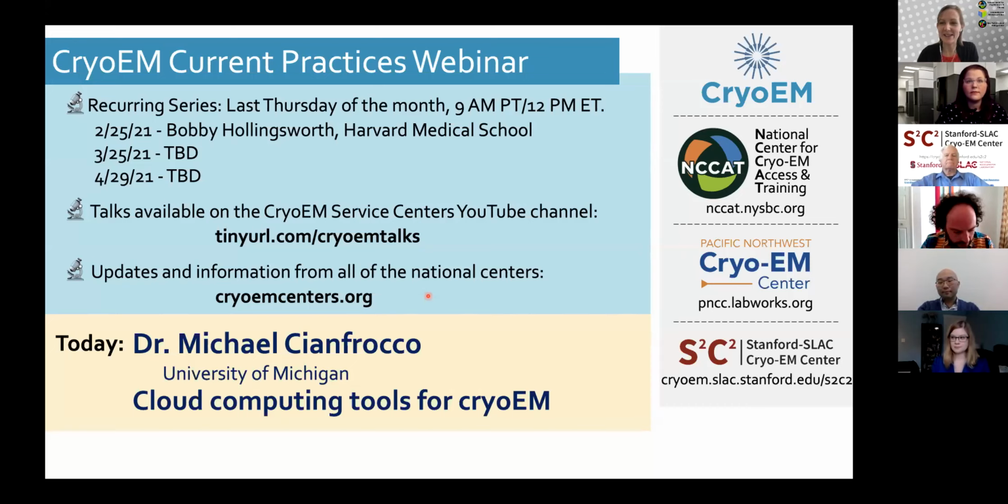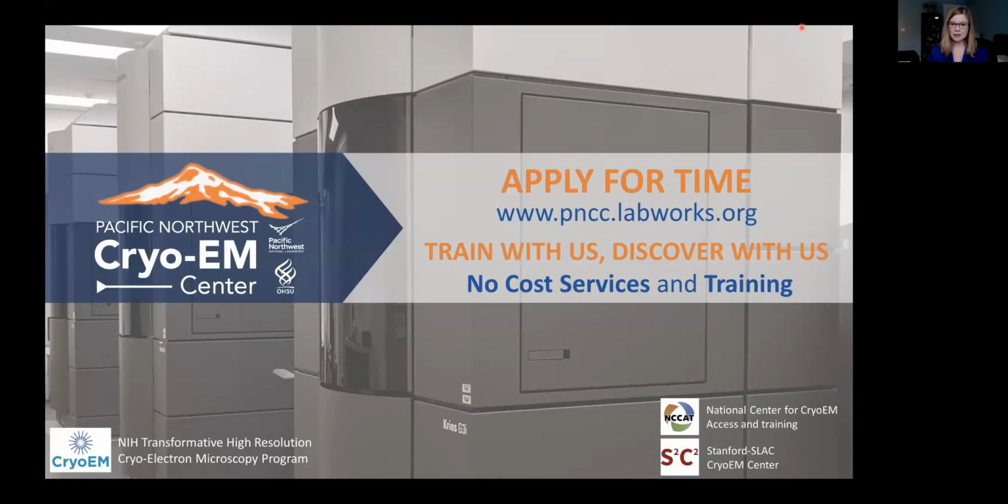At PNCC, we have two proposal types, and those are limited access for preliminary data sets up to 24 hours and general access for larger projects up to 480 hours per year for 2 years.